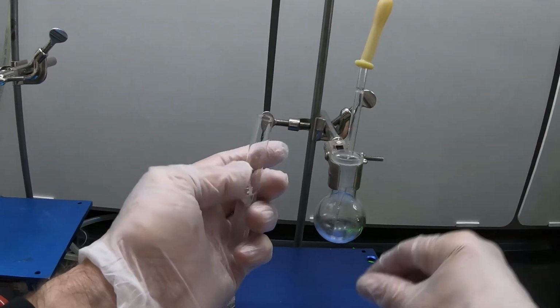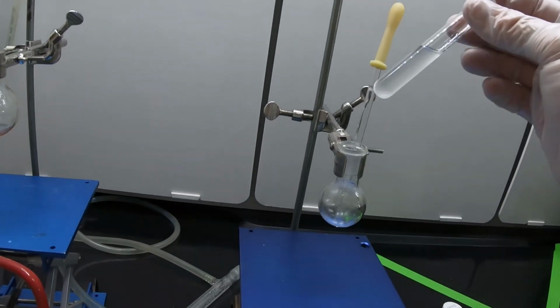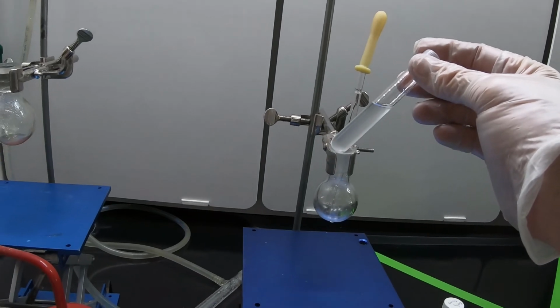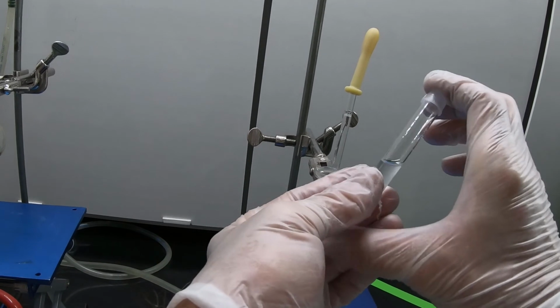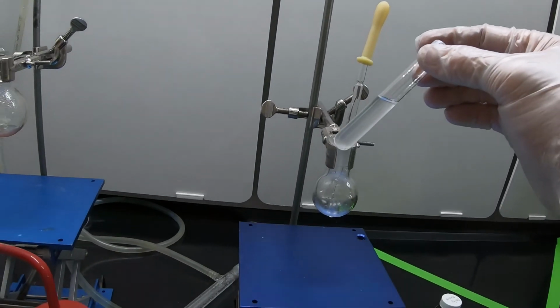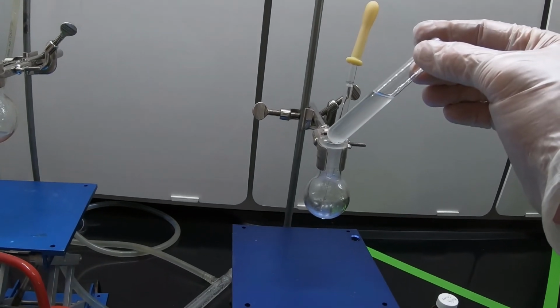And there we go. 35, 40 minutes of experiment. We have murky material. This will undergo GC mass spec analysis in the Kelowna lab, of which this material is fairly volatile. It's going to be a little smelly. And we will supply each student with a copy of the mass spec of this reaction vessel to be incorporated into their report.